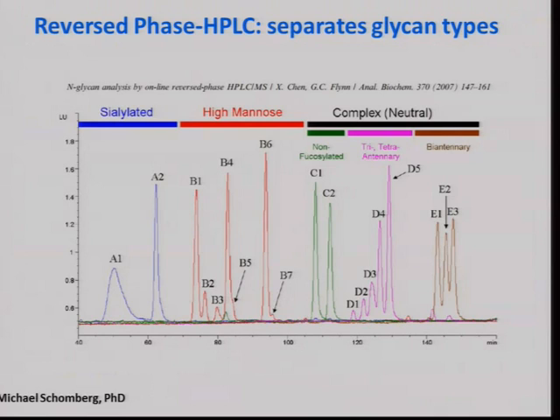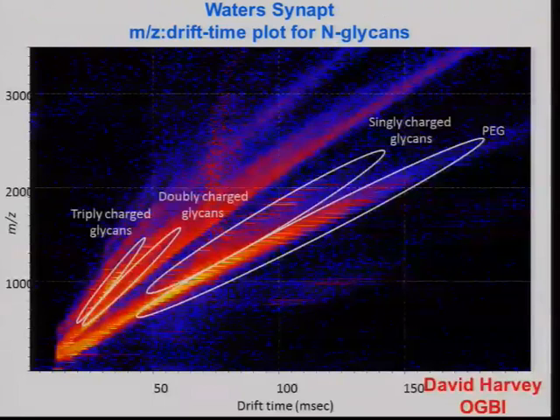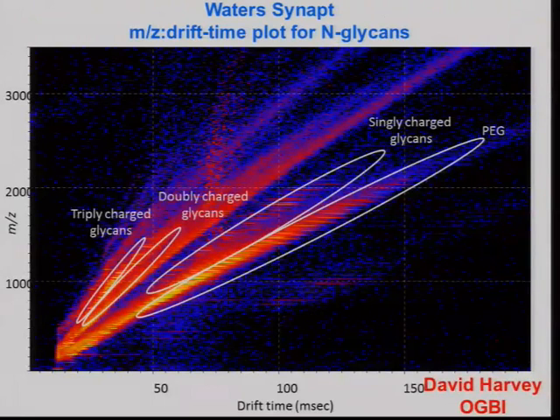And it's because the gradient is so shallow, and you get diffusion, and so I think this has specific uses, and where you're like Roche, you need it. It's extremely good. But if you're just starting, this is not your number one technology to use. Use CE, use LC, but I wouldn't use this unless it has features that are really important to you.